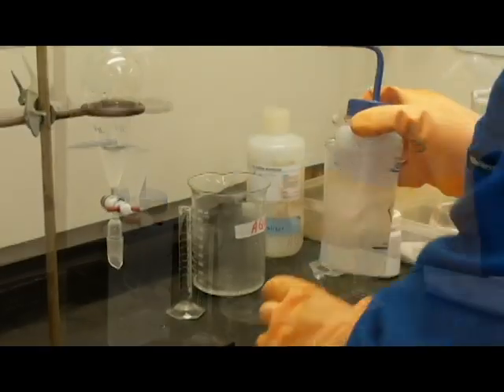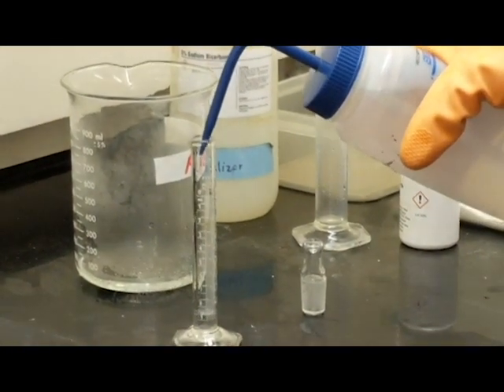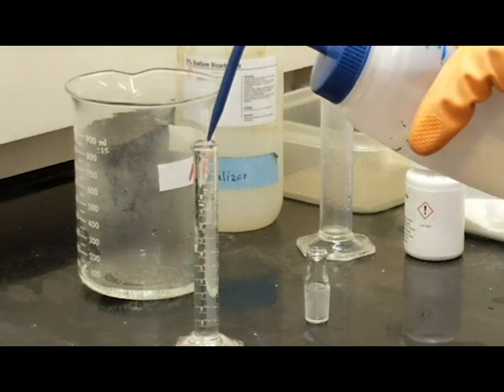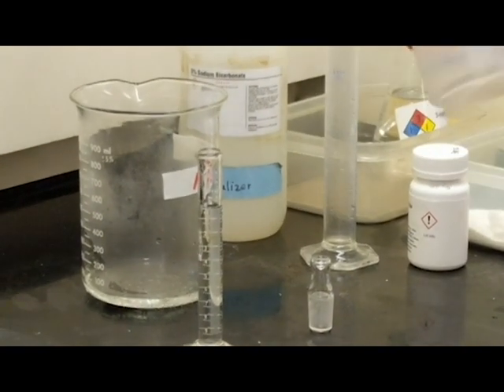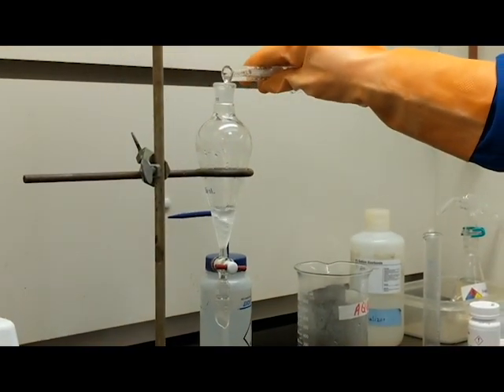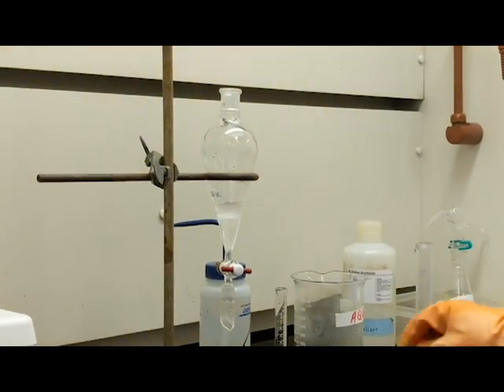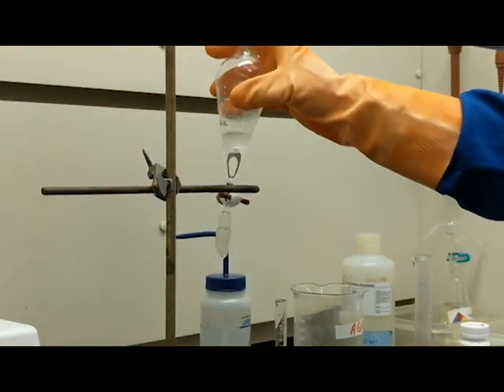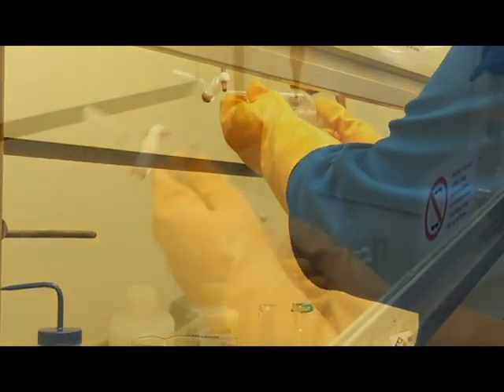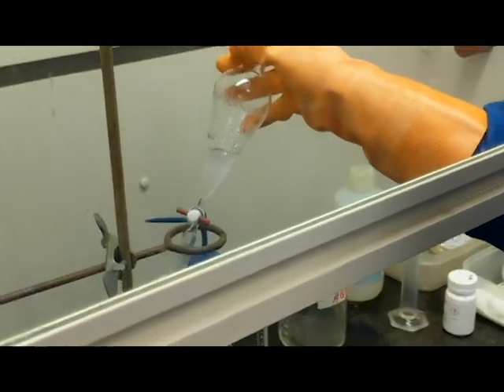Wash the organic layer again with 10 mL of water. The purpose of these extractions is to remove and neutralize the remaining residual hydrochloric acid from the final product. Again, this measurement does not have to be accurate. A good rule of thumb for these extractions is that each one should last about 5 minutes. That's been 5 minutes.